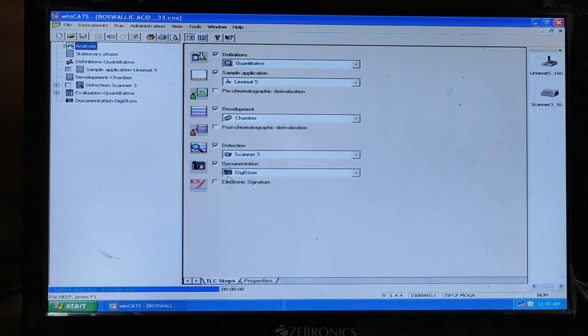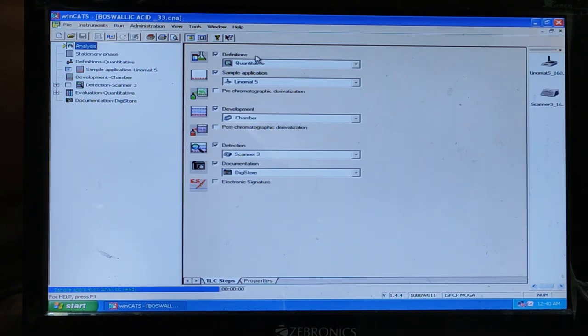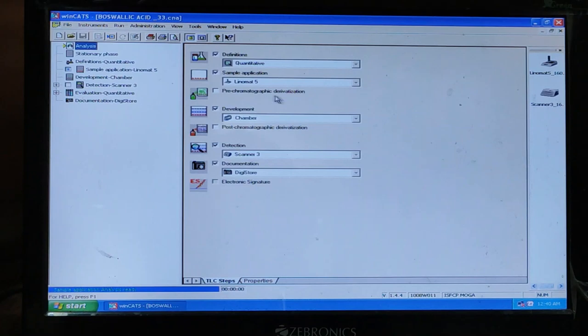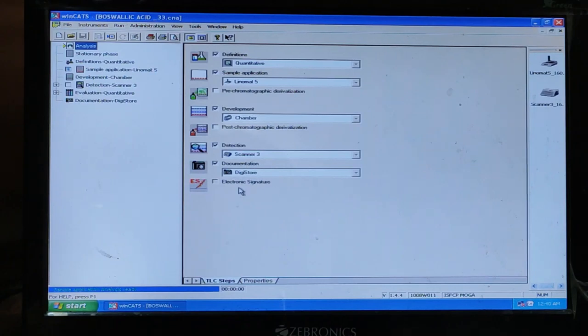And all these heads are automated by WinCat software. These heads include definitions, sample application, pre-chromatographic derivatization, development, detection, documentation and electronic signature.